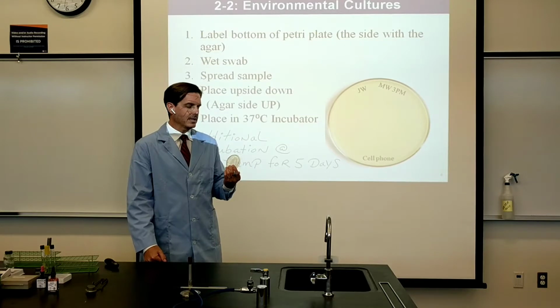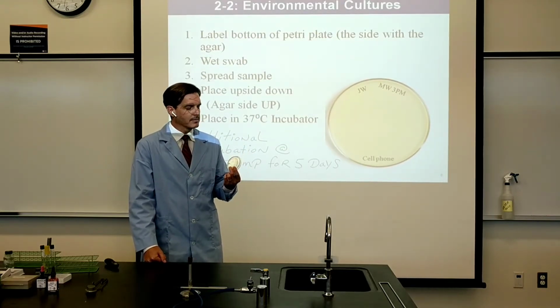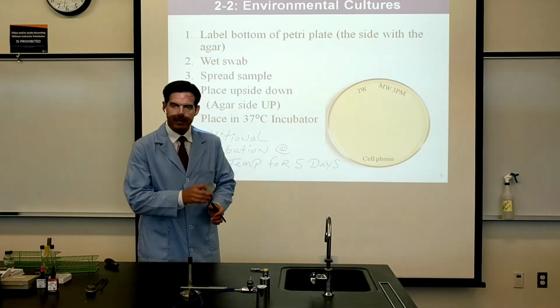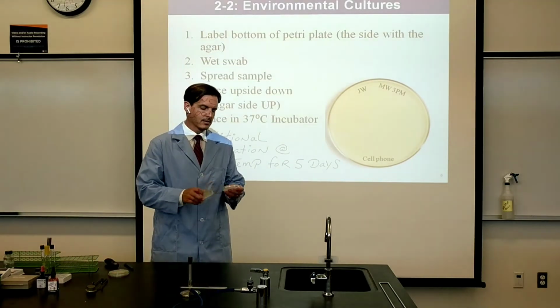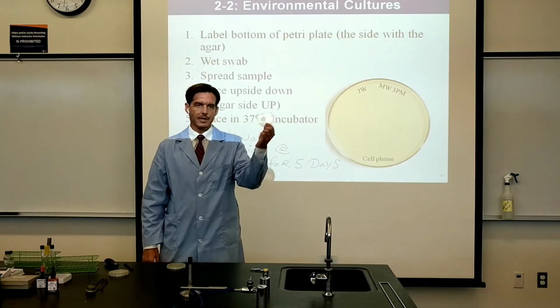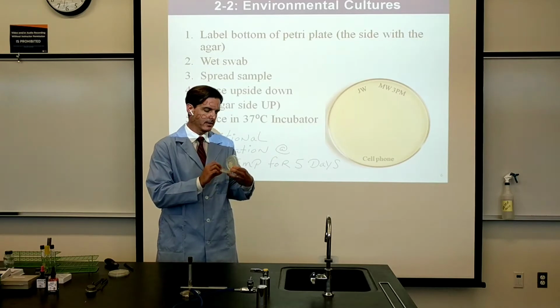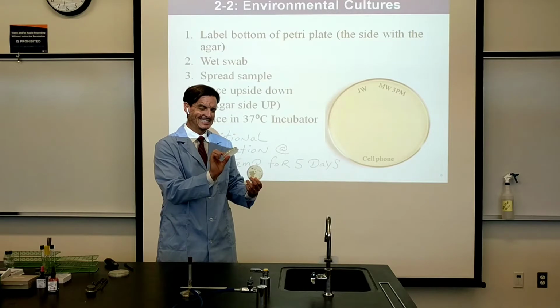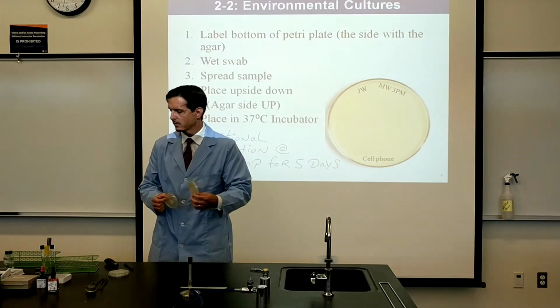But before we incubate these all at room temperature, which may give mold a chance to grow, because they grow better at room temperature and they grow more slowly, let's take a look back at my other samples. They're much more interesting than the empty plate that the room air produced. Here's a plate that's from my left shoe, and it has a whole lot of growth here that we'll take a closer look at, and also the plate from my cell phone. Ew, it grew a lot as well. And so let's take a look at these a little more close up.